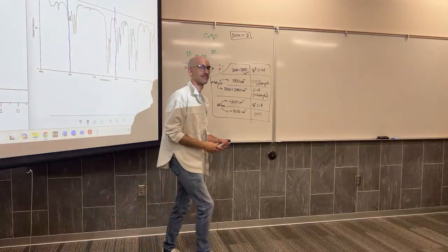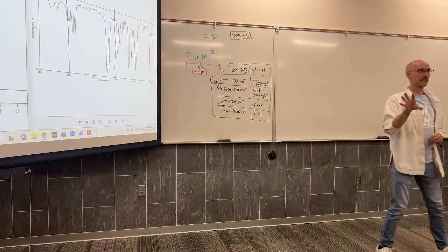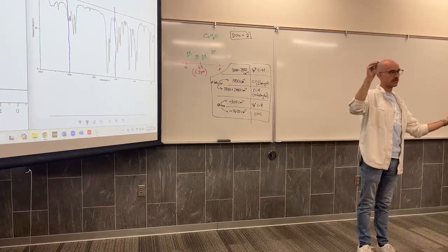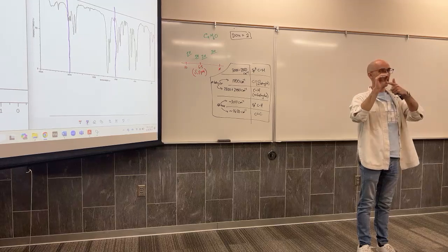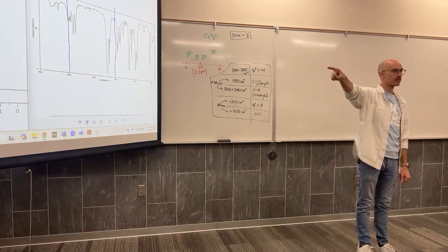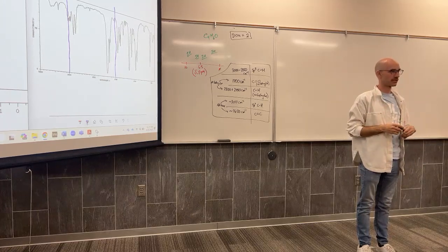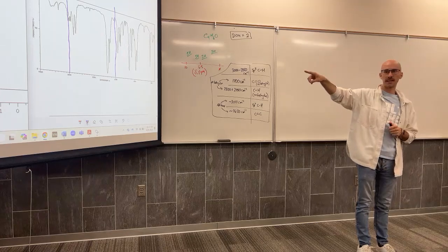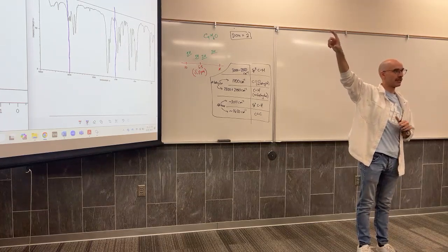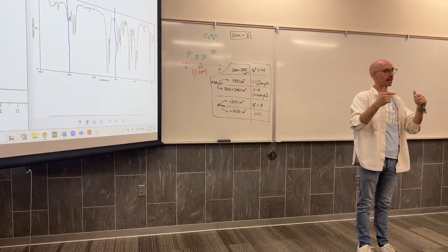3H. So I remember we were counting the 1 H, 3 H's though. What was the difference? Peaks tell you how many neighboring hydrogens that hydrogen has. So hydrogens are making these signals. Neighboring hydrogens are changing the peaks on the signals. Hydrogens make these signals, and their integrations tell you how many hydrogens make that signal. The splitting pattern, the multiplicity, is affected by the neighboring hydrogens.